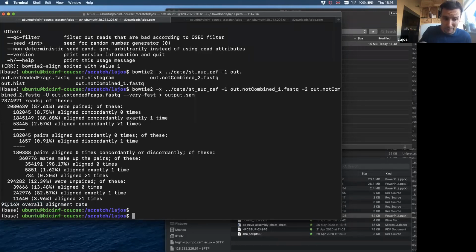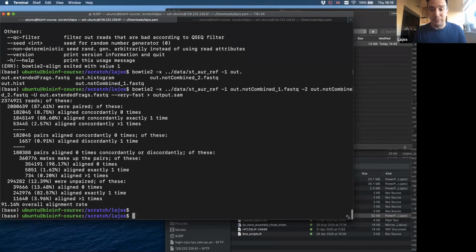So this is what I told you, that probably we won't see any AMR genes in our alignment file. I don't know if mecA is there in this reference genome or not, but that means that you are losing important information. But again, we are not aiming for finding everything now. That's not our final aim in this case with the alignment.